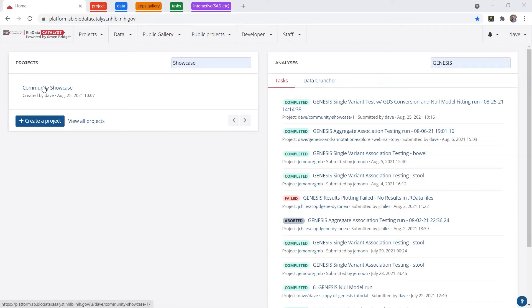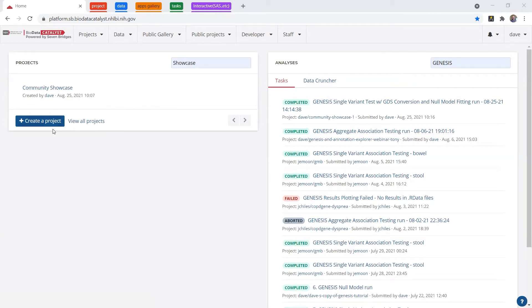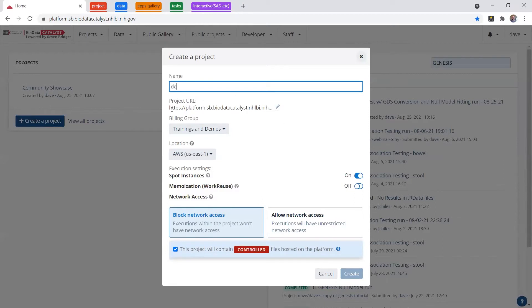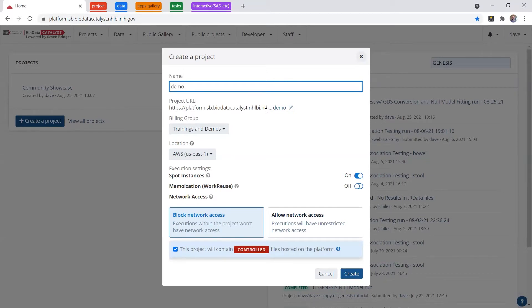So I made us a project called Community Showcase, which I'm going to give you a tour of. But first, I want to show you how you can quickly make a project for yourself. If you just click Create a Project, you can give the project a name, which creates a URL which you can bookmark for later use, and that's private only to you.